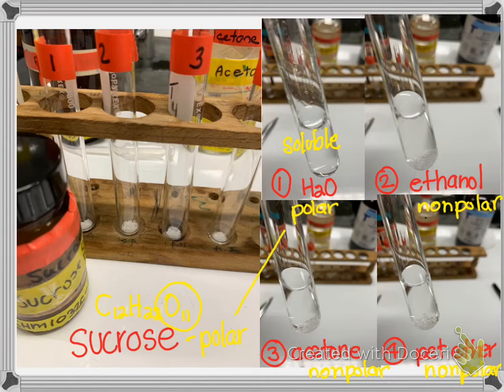Now looking at the others, their solid remains there, so it's insoluble, solid, and solid. And this makes sense because the general rule is like dissolves like, but polar and nonpolar are not alike, so it doesn't dissolve. Right? Like dissolves like. So polar dissolves other polar substances, and nonpolar solvents dissolve nonpolar, but nonpolar won't dissolve polar.